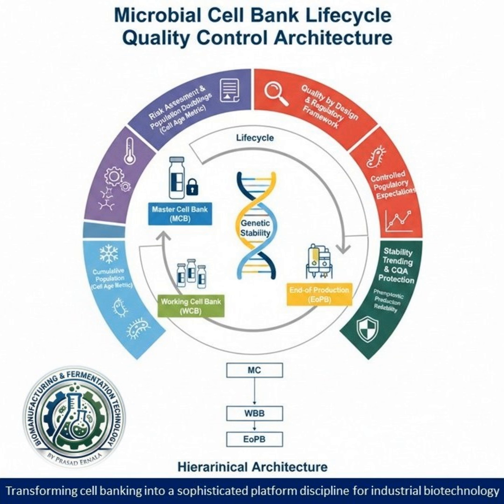So it's the vault copy. You characterize it once, you test it exhaustively, and then ideally, you never use it for routine production. Precisely. It's stored at ultra-low temperatures, less than or equal to minus 130 Celsius in vapor phase liquid nitrogen. And that's to stop evolution, basically. To minimize it, yes. It's also made with the fewest possible cumulative population doublings, so it's as young and as stable as it can be.